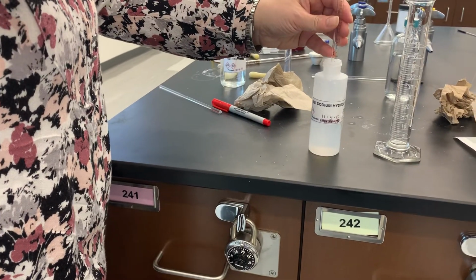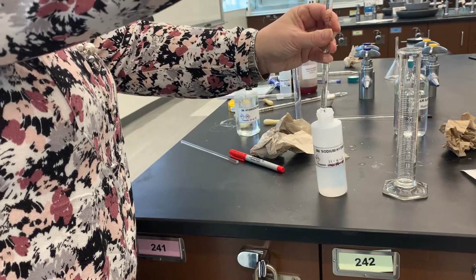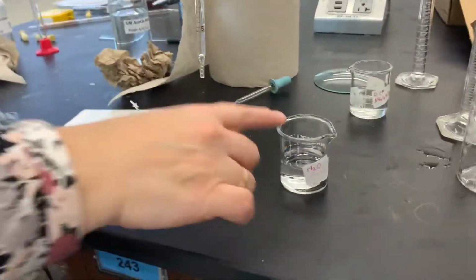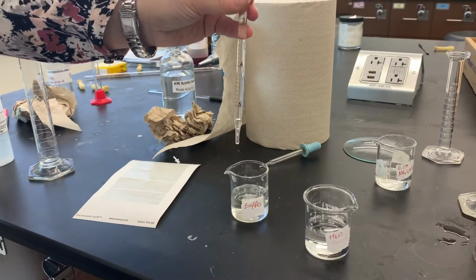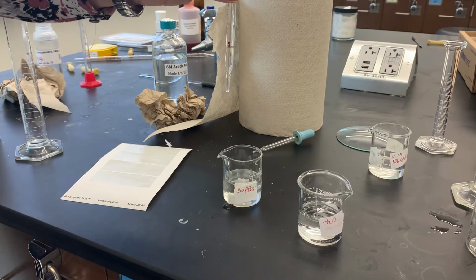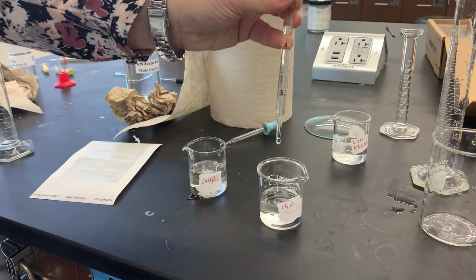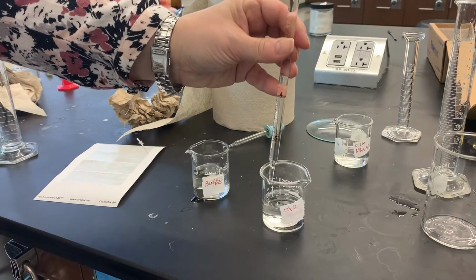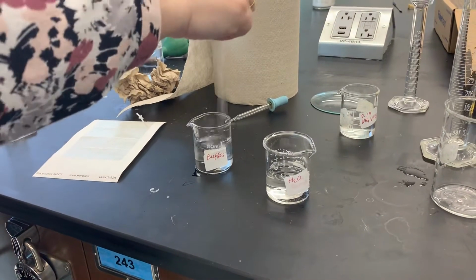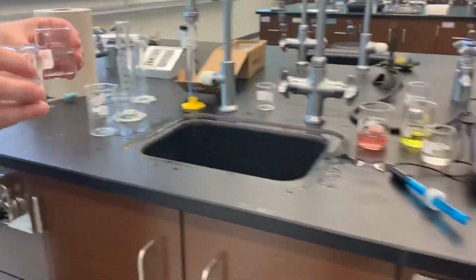So once again, this is a 5 milliliter pipette. I'm going to fill it up to 0 with 6 molar NaOH, and then 0.5 milliliters of 6 molar NaOH is going to go into each of these two beakers. First into buffer, and now into water for a total of 1 milliliter. 0.5 milliliters into each. I'm going to use my stirring rod to stir. And now we can go ahead and measure our pH.